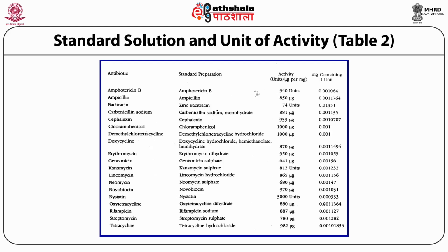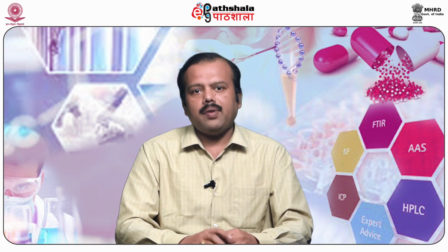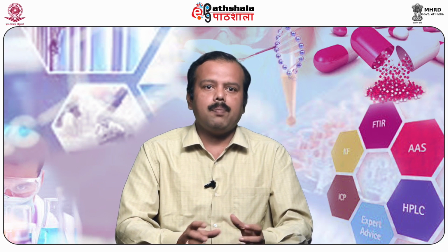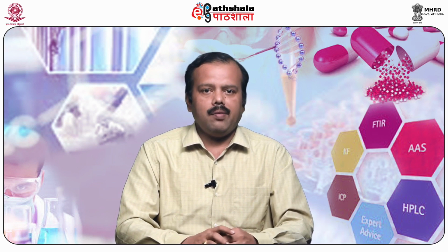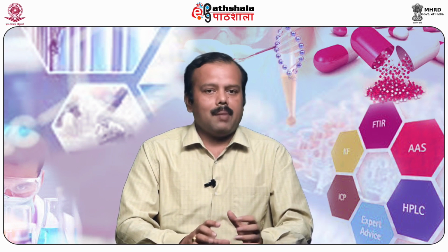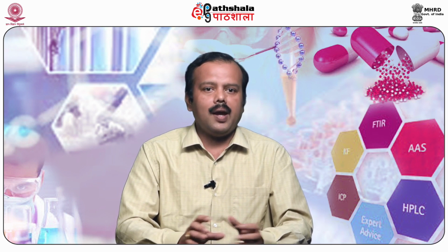of bacitracin is equal to 0.01351 milligram. Test microorganism and inoculums. What type of test microorganism can we use for antibiotic assay, and how is the inoculum or the seed culture of the microbe prepared? The test microorganisms are different for different antibiotics, that is explained in table number 3 and 4. The microbial suspensions were prepared as per the method given in table number 5.